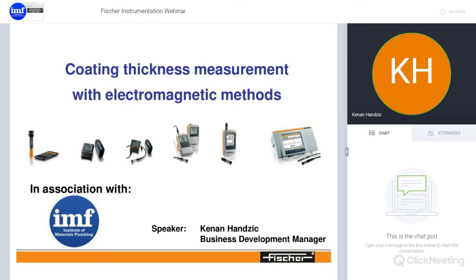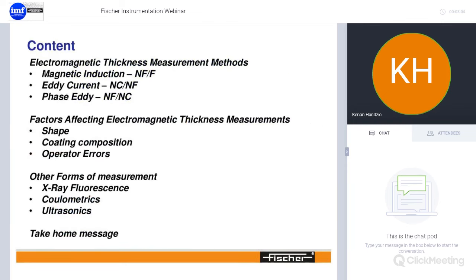Today I have been kindly invited by John to talk about coating thickness measurements with electromagnetic methods. On the agenda we have the currently used methods for measuring coating thicknesses, the factors affecting electromagnetic thickness measurements — such as the shape of an object or the coating composition — possible operator errors, and external influences. I will also briefly touch on other forms of measurement in our range: x-ray fluorescence, coulometrics, and ultrasonics. The take-home message is how we can eliminate most of the errors seen when taking measurements.